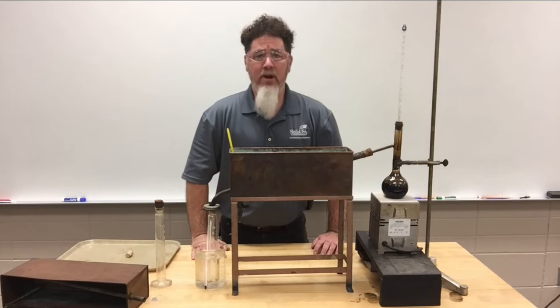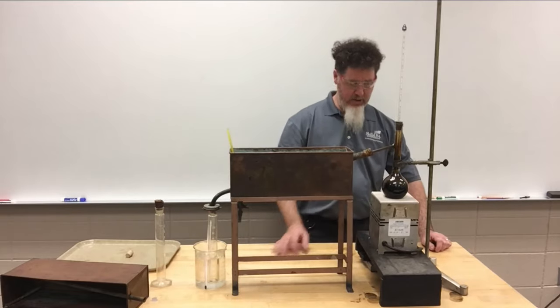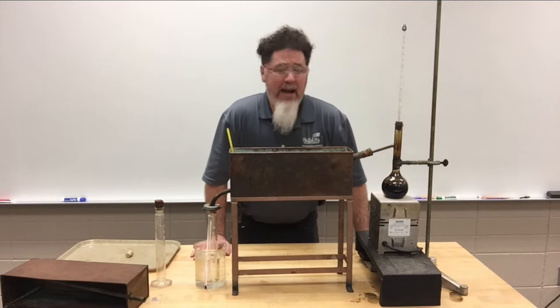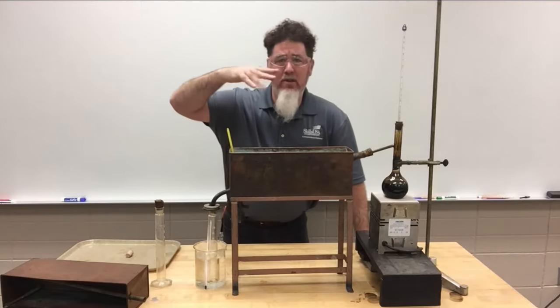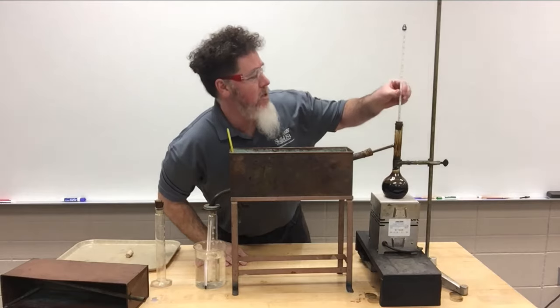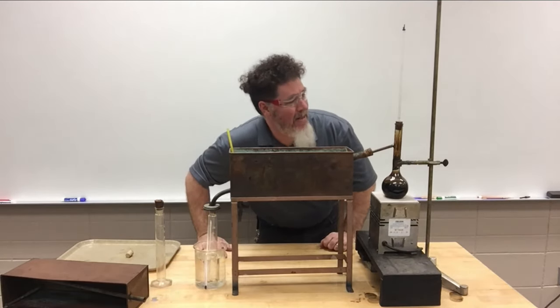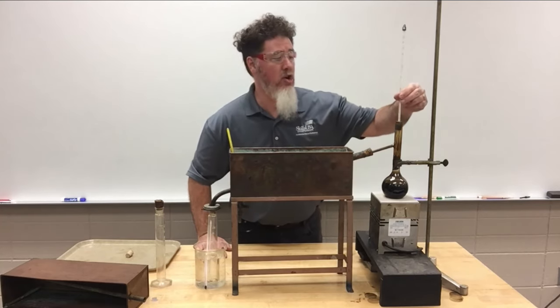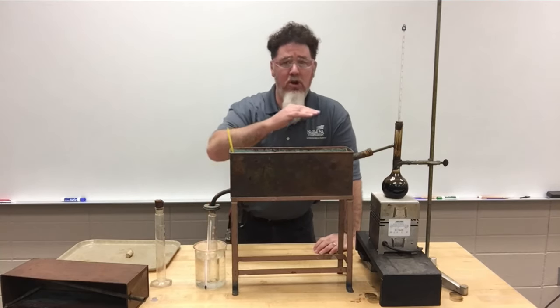We started the heating process for the oil, so I turned the electric heater on to a position of 4, so not very hot, and it's been on for about 5 minutes now, and I can see that the oil is starting to boil just a little bit. I can start seeing the liquid start to move. If you take a look at my thermometer, it's reading 77 degrees, somewhere around there. So it just started to rise. It did start at 75, and so it's slowly starting to go up.